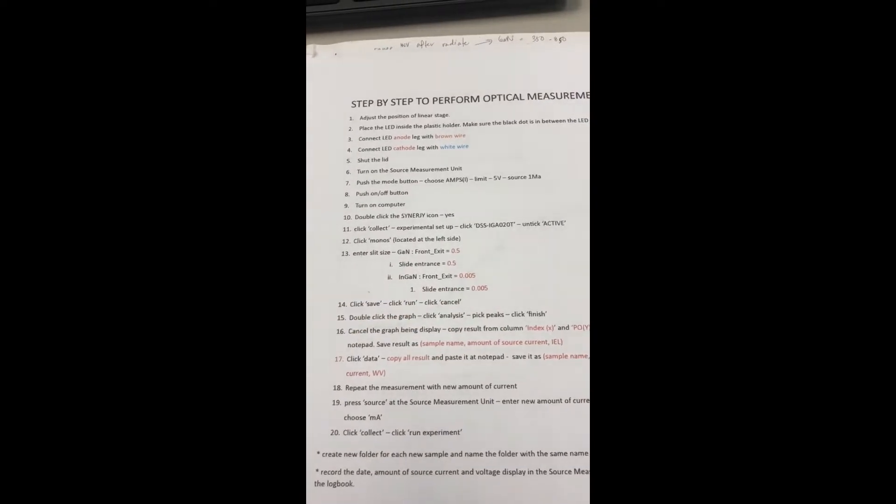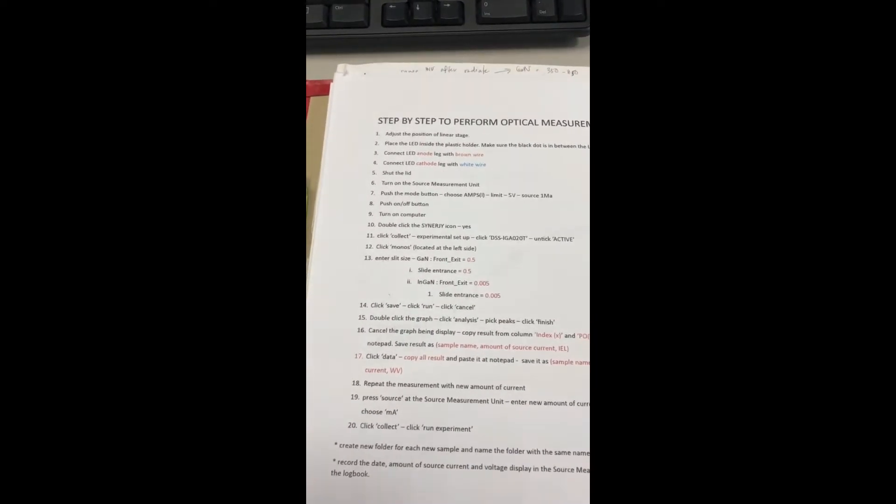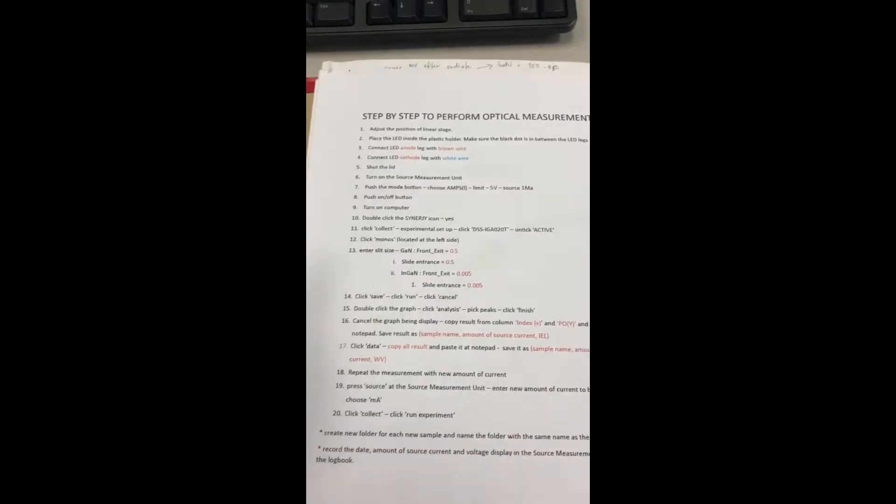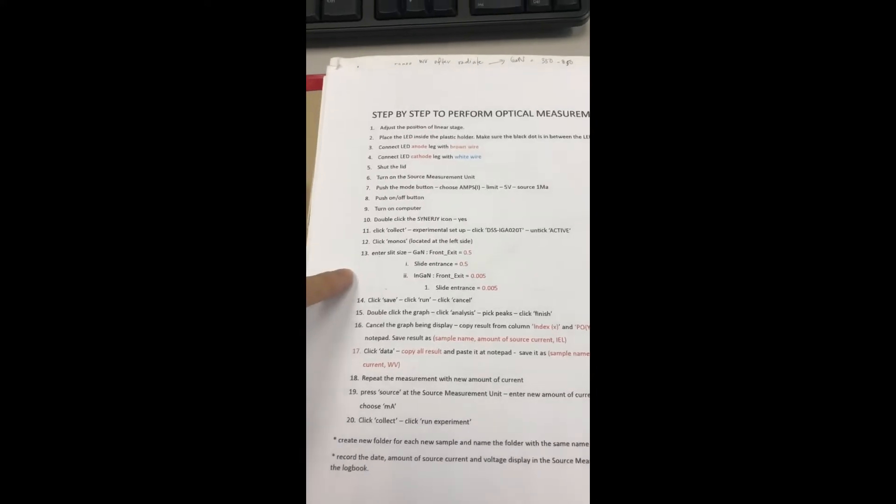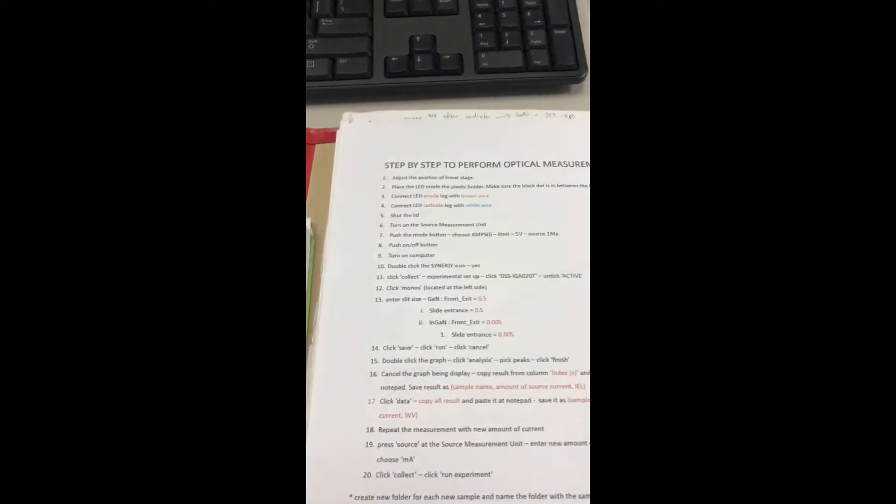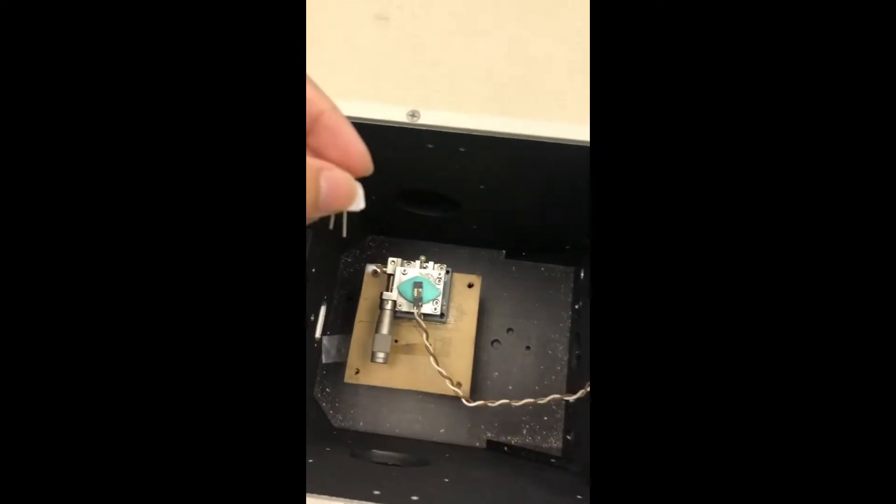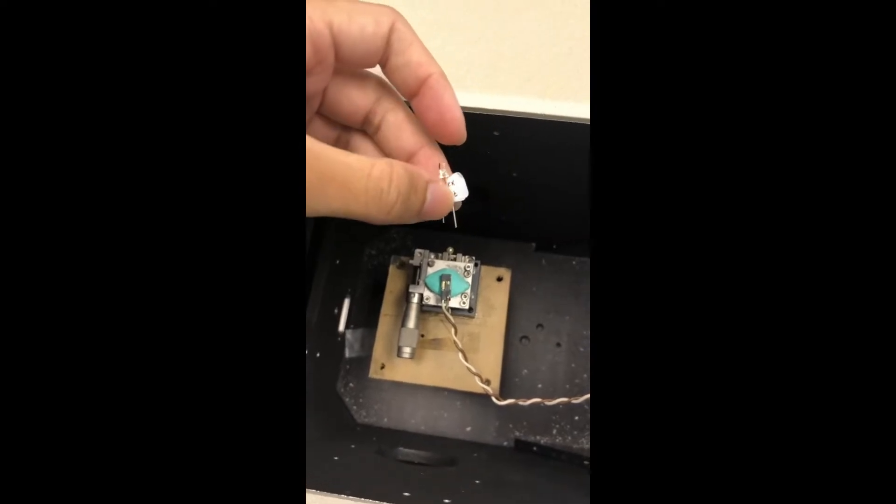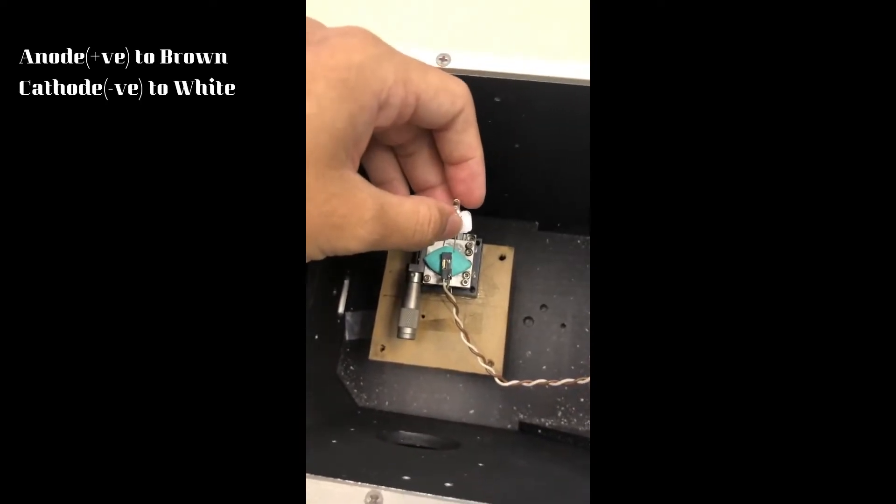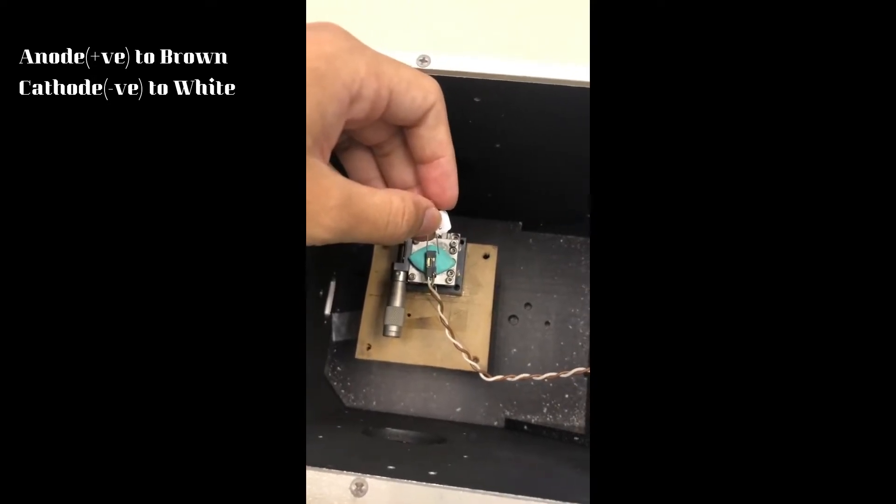Now I will show you how to set up an LED inside the Horiba machine after you have followed all these steps to set up the computer. So this is how the Horiba machine inside looks like. We need to connect the anode to brown wires and the cathode to the white colors.